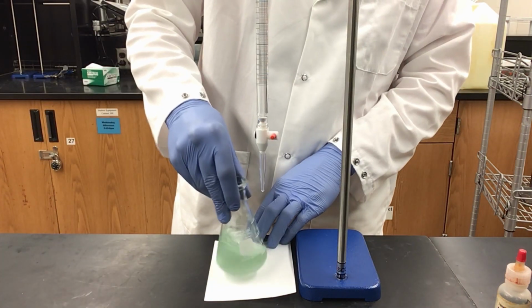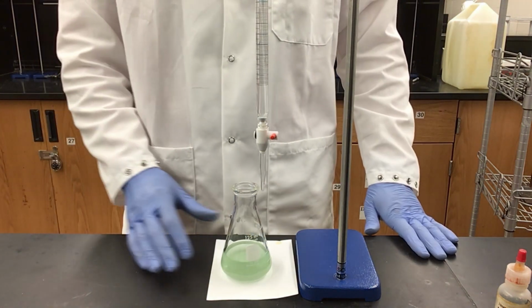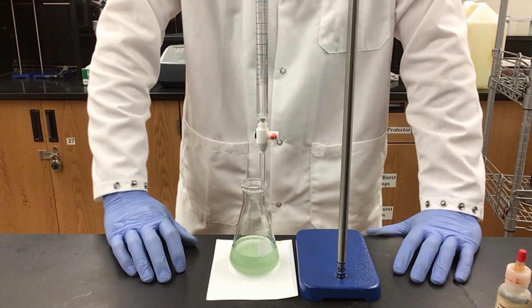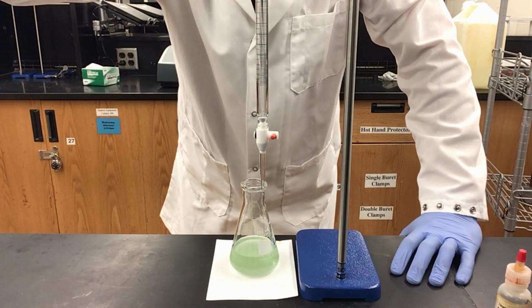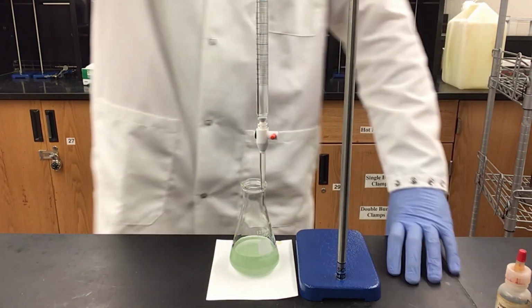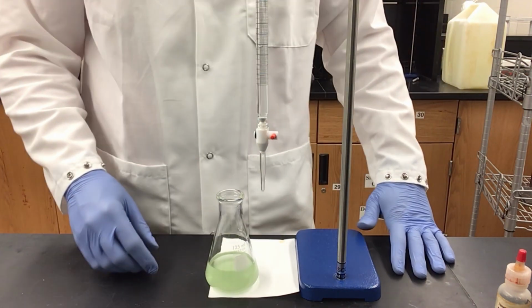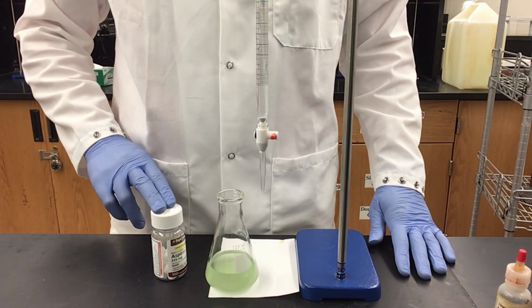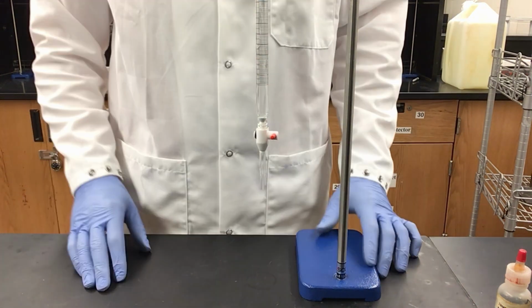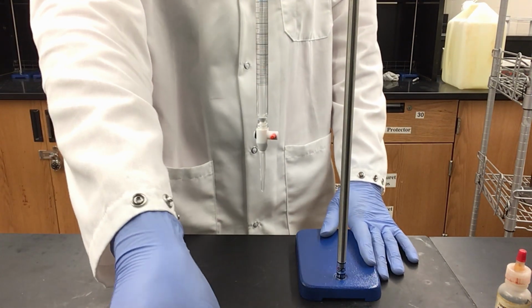And there we go with that final drop. I have gotten my light green color in solution, so I can stop and record the volume of sodium hydroxide I used, which is 17.7 mils of sodium hydroxide. And now we can go ahead and calculate the true amount of aspirin that we have and see if our label was correct.